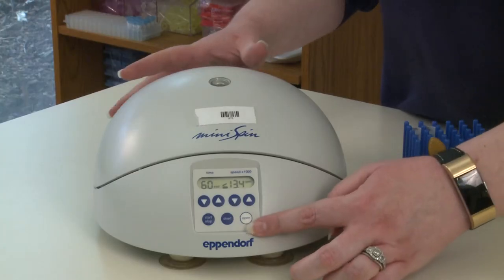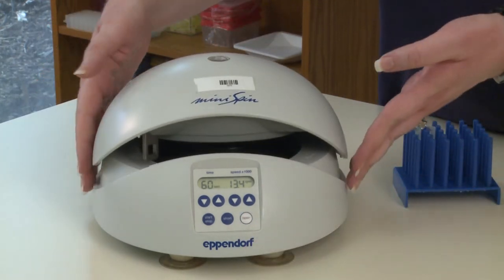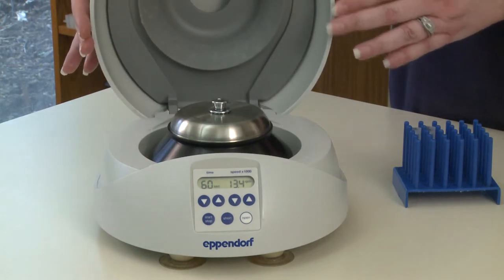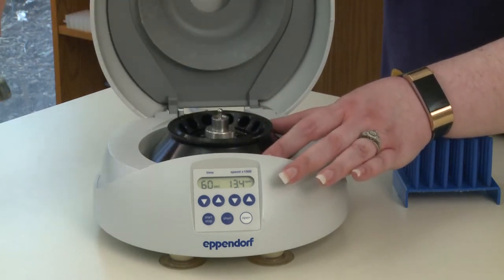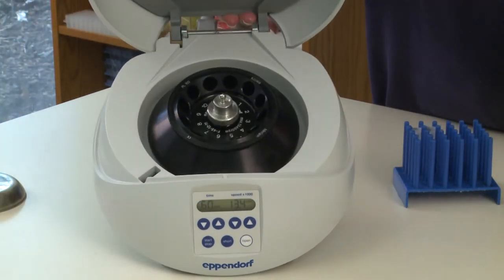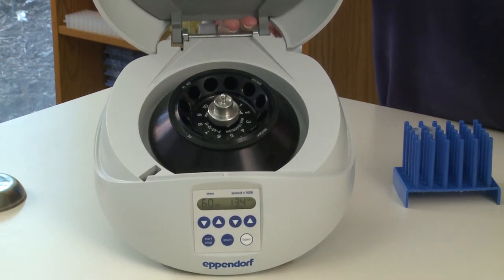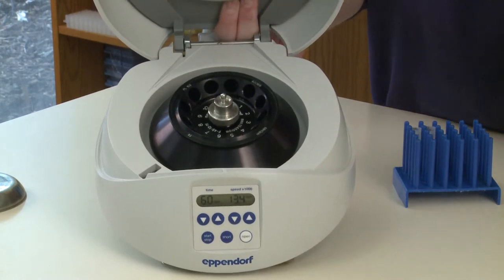To use the centrifuge, on the bottom left-hand side there's an open button. Press that button and the lid here will pop up automatically. Gently pull up on the lid and remove the small inner lid inside by pulling straight up on the knob and placing that lid aside. Inside the centrifuge is the rotor. This particular rotor holds 12 tubes so we can put 12 samples in here at once. The rotor is what spins our samples very quickly.